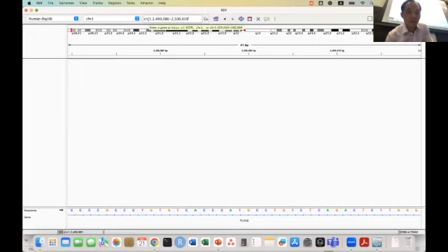And then somehow it automatically gets replaced with the CHR. So the standard notation for chromosome 1 is CHR, followed by the number and colon and then the beginning position, and then the ending position of the interval. So that's what you are looking at.